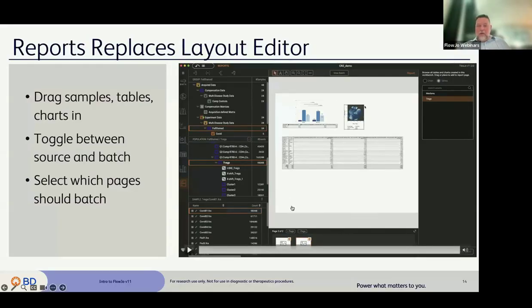Reports have gotten quite a bit of work in v11.1, so you can now normalize histogram overlays to modal scaling. Everything is SVG graphics, and again, there are high resolution options, so you can toggle from the standard 256 DPI to 512 to 1024 and see higher resolution graphs. You can make them as big as you want. All of the drawer options over here are what we're going to focus on when we get into the demo here.